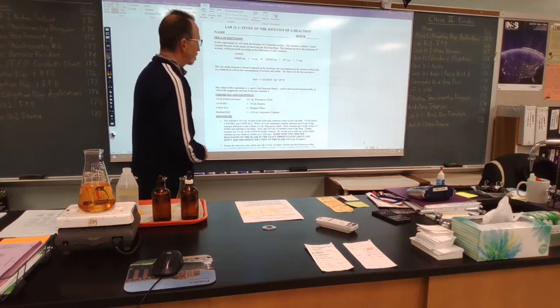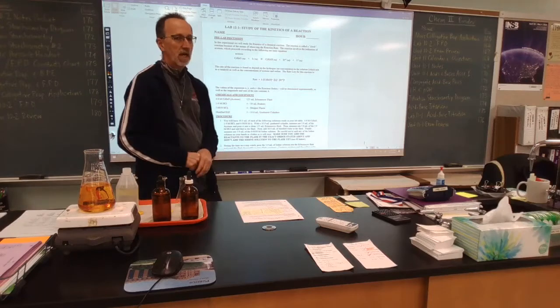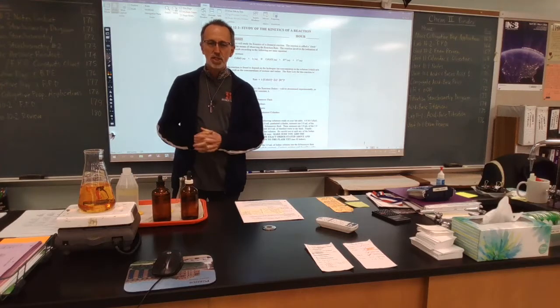The reaction is called a clock reaction because of the means of measuring the rate.